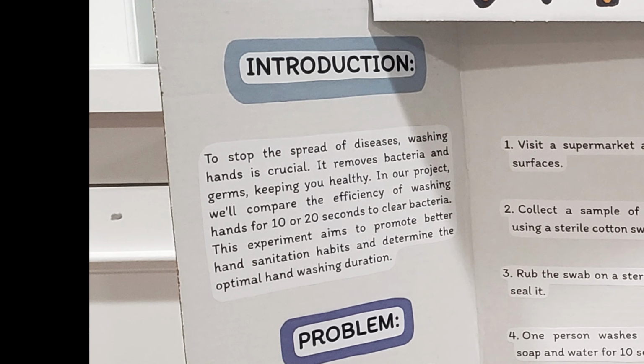Introduction. To stop the spread of diseases, washing hands is crucial. It removes bacteria and germs, keeping you healthy. In our project, we'll compare the efficiency of washing hands for 10 or 20 seconds to clear bacteria. This experiment aims to promote better hand sanitization habits and determine the optimal hand washing duration.